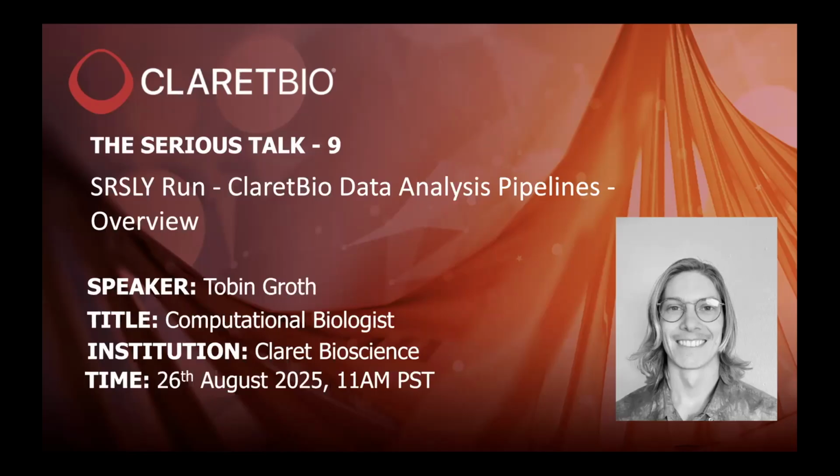Keeping that in mind, today's talk is slightly different because we've never done a bioinformatics focused one before. Here we'll have our star bioinformatician, Tobin Groth. He will give you an overview of some of our pipelines. These are data analysis pipelines that we offer for free on our website. These are all open source software. And in this talk, Tobin is going to go over installation, running, usage, etc.